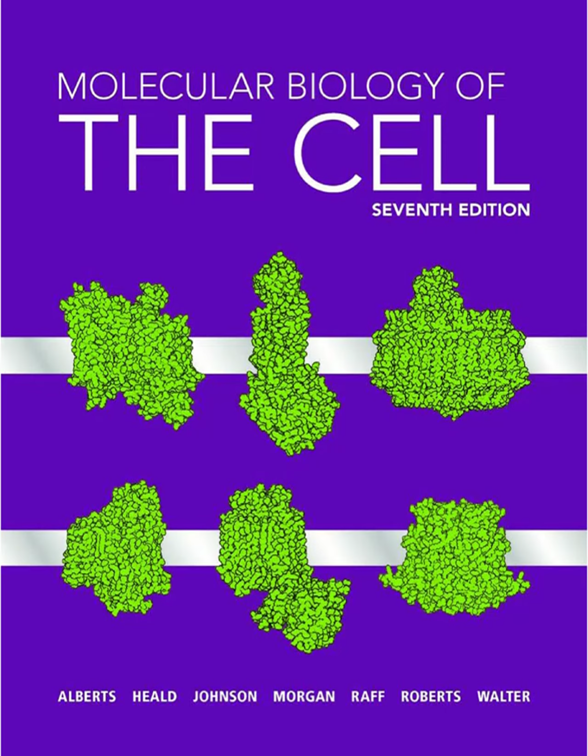Wow. That sounds like it could easily introduce artifacts. It absolutely can. Which is why rapid freezing, or cryofixation, is considered the gold standard for preserving structure most faithfully. Freezing so fast that ice crystals don't form. Exactly. You plunge the sample into a cryogen like liquid ethane, cooled by liquid nitrogen, achieving cooling rates of thousands of degrees per second. Water vitrifies, becomes a glass-like solid without forming damaging crystals.